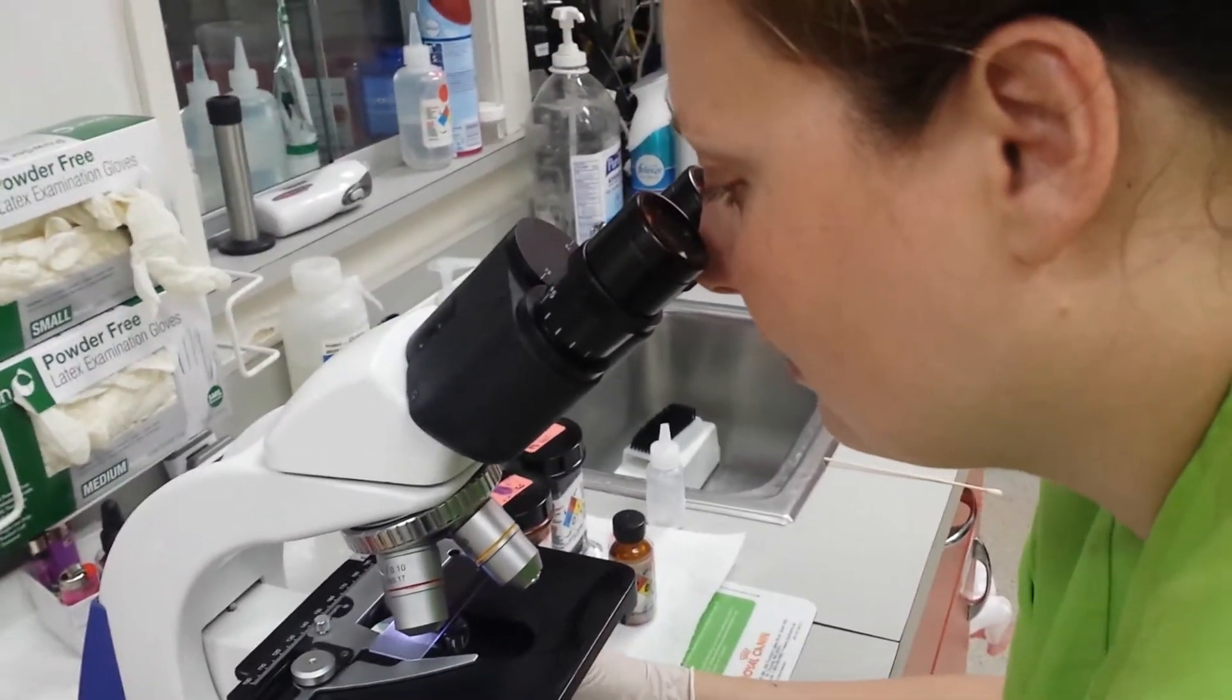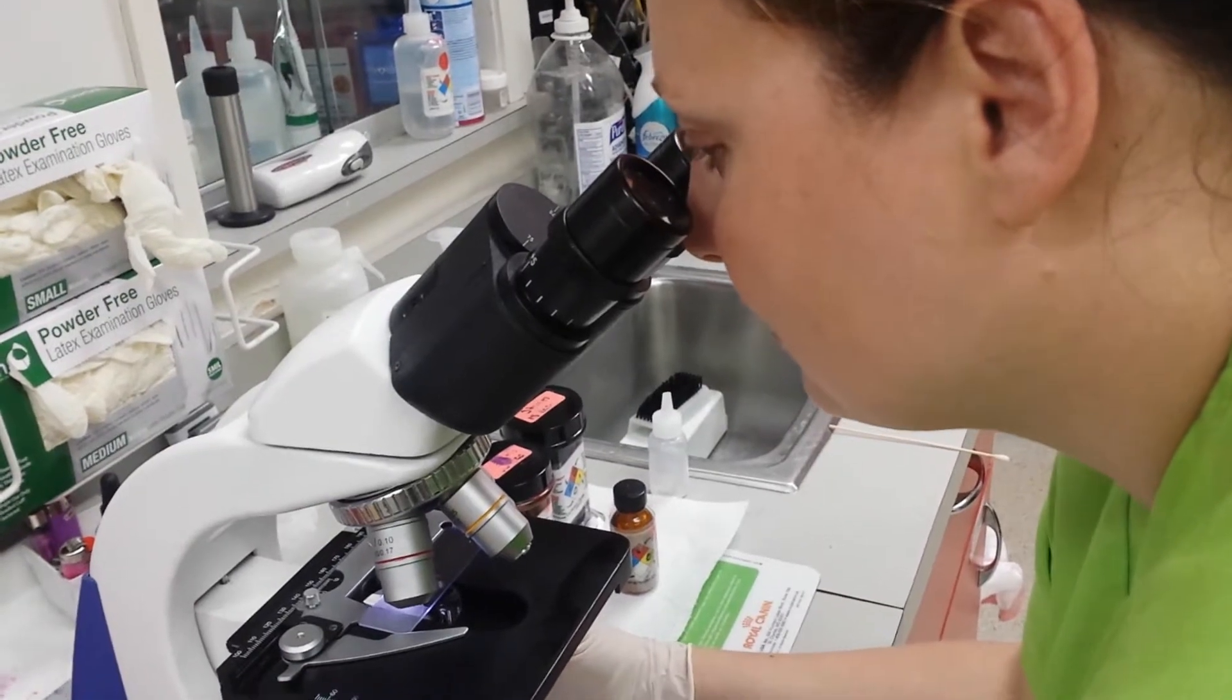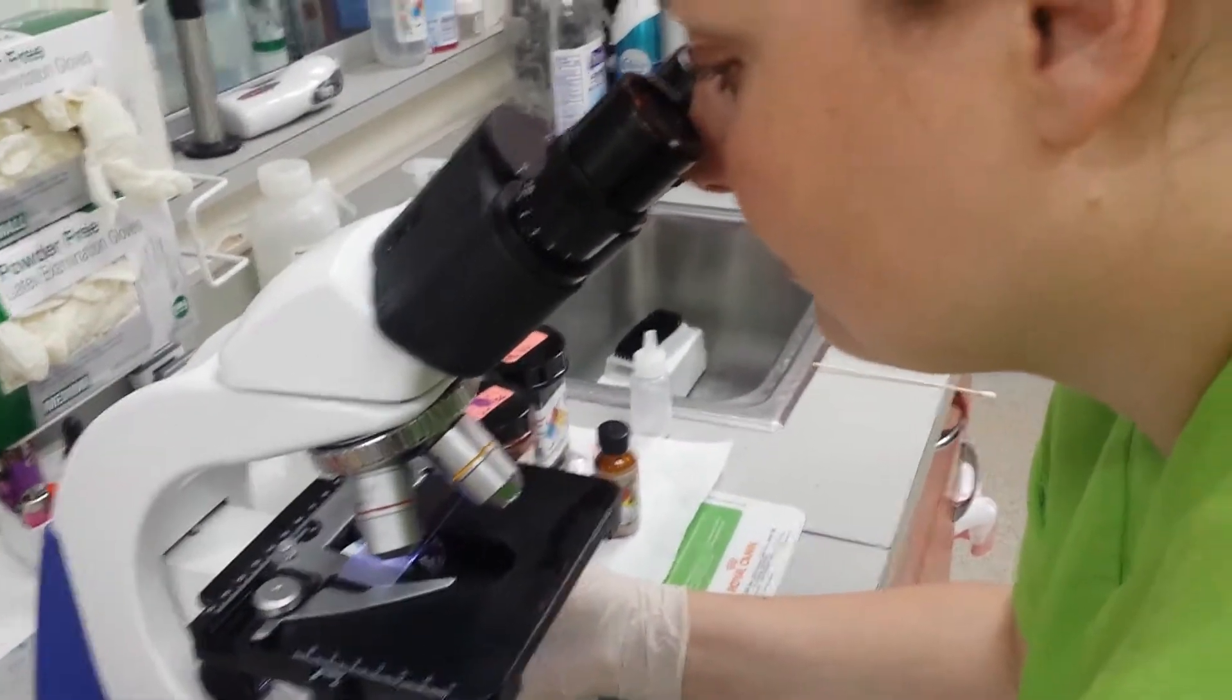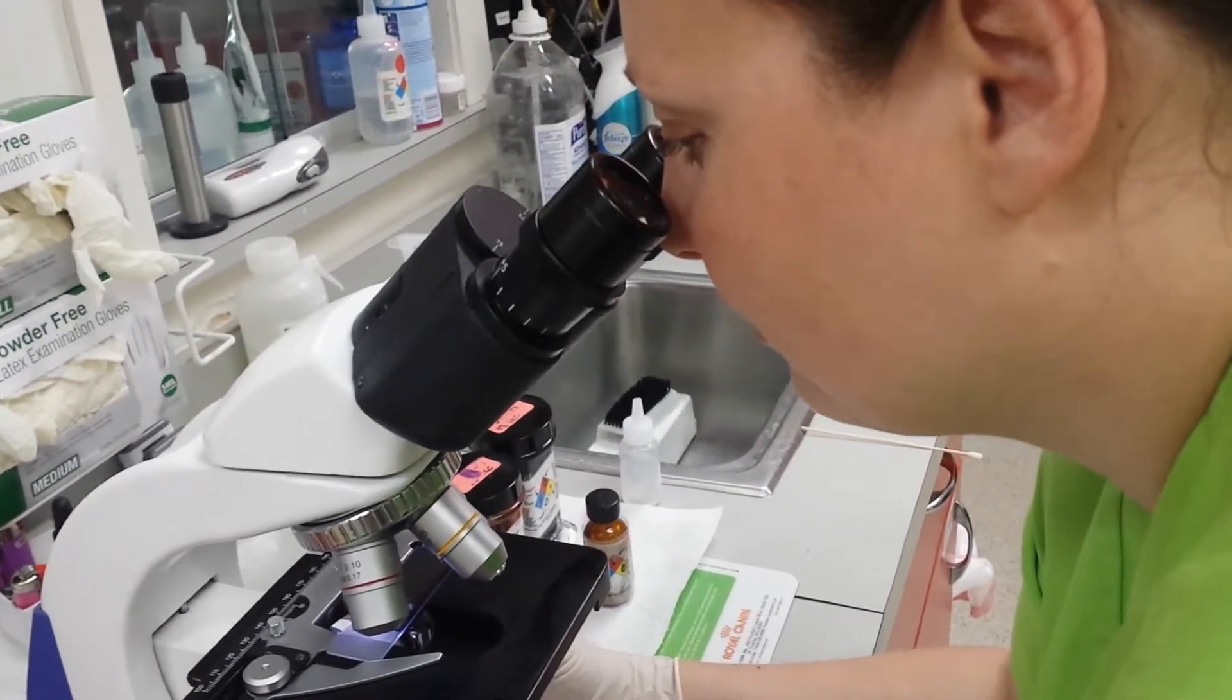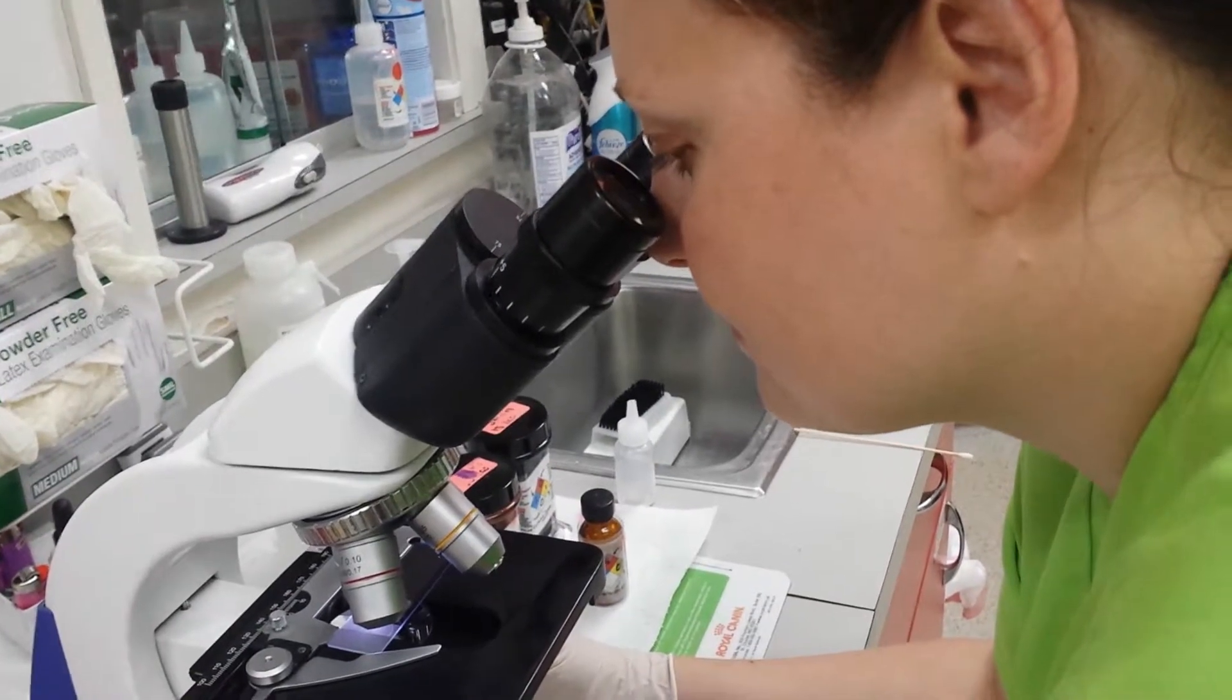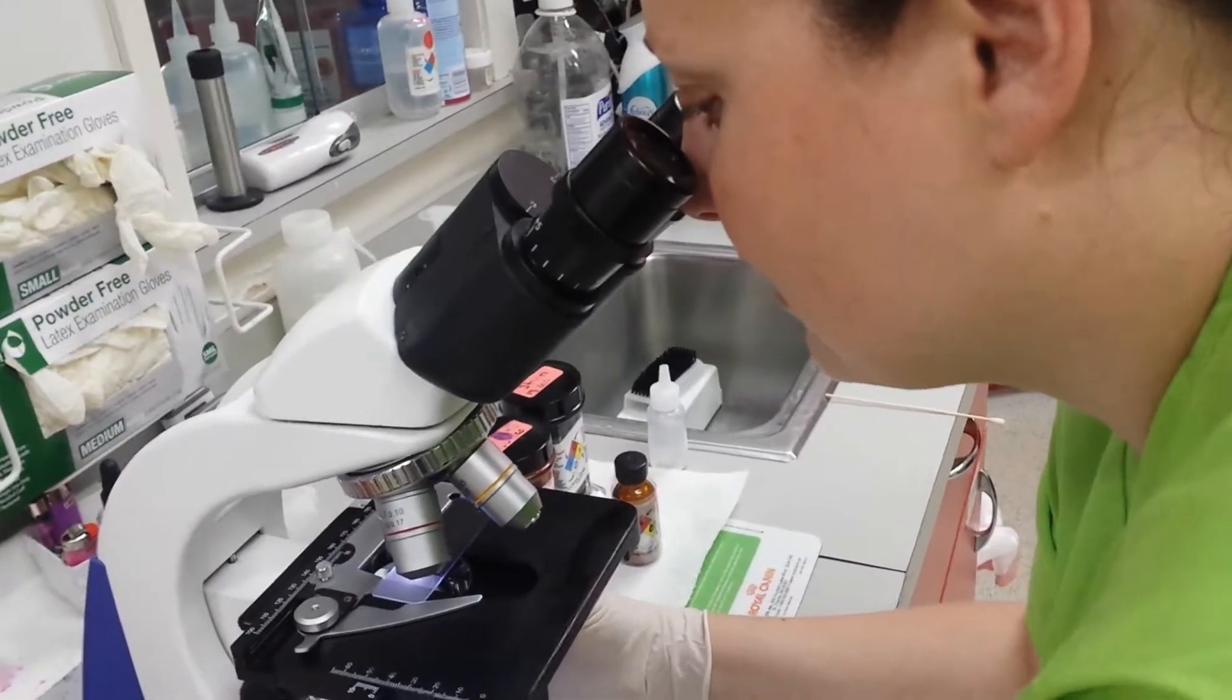...and work our way from one side of the slide to the other, just looking for the different cells that we would find. So there are quite a few epithelial cells, there's some cocci as well, some red blood cells.